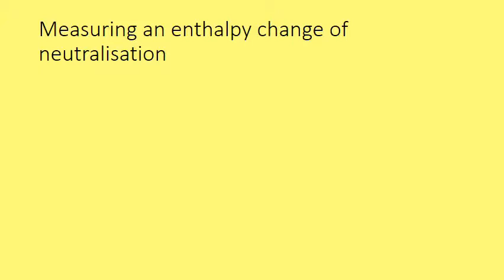What we're going to do now is a neutralization reaction, and this would be the subject of the practical as well. So we're going to measure the enthalpy change of neutralization. First of all, let's just remind ourselves of the definition of enthalpy change of neutralization. It is the energy change when 1 mole of water is formed from the reaction of an acid and an alkali.